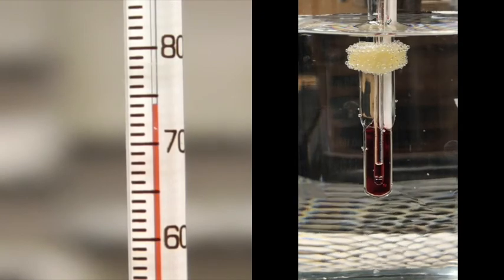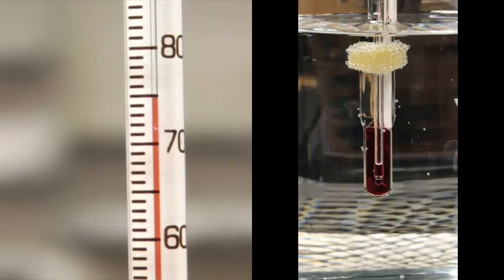So with our next sample, we're going to try to get that range a little bit smaller by slowing the heating down. When we get to about 65, I'm going to slow the heating down.